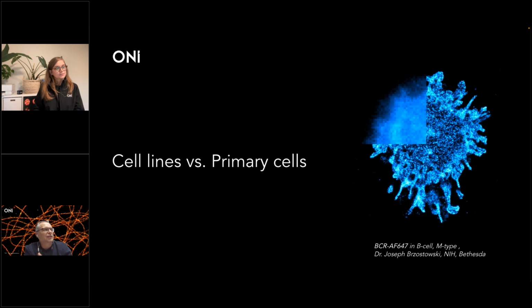One of these actually very good examples is the T-cell receptor. There are antibodies which are actually for the T-cell receptor, but they don't really work when you are fixing your cells. And that's why, as an alternative to T-cell receptors, people use CD3 or anti-CD3.